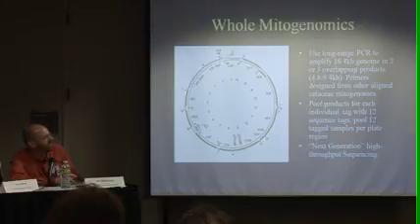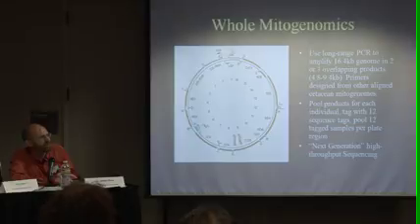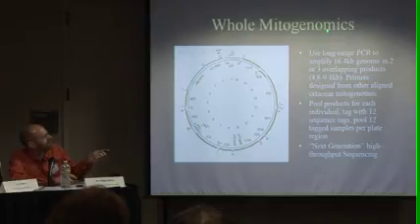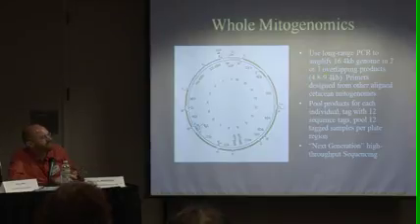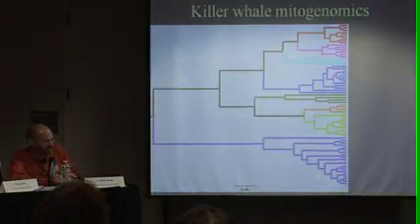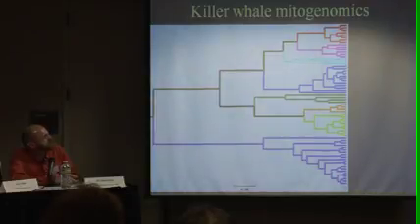got more information? So with the ability to do next generation sequencing, we were offered the chance to sequence whole mitochondrial genomes for up to about 150 individuals through a collaboration with one of the companies that markets the technology. And so we used a long-range PCR method, which requires that you have fairly good quality DNA, and PCR amplified fragments of between 5 and 10 kilobases each to cover the entire mitochondrial genome. And then we pool individuals and send them off to the company to do the sequencing. And I'm going to get right to the results in the interest of time, but I'll get back to it and talk about this technology a little bit more in a second.